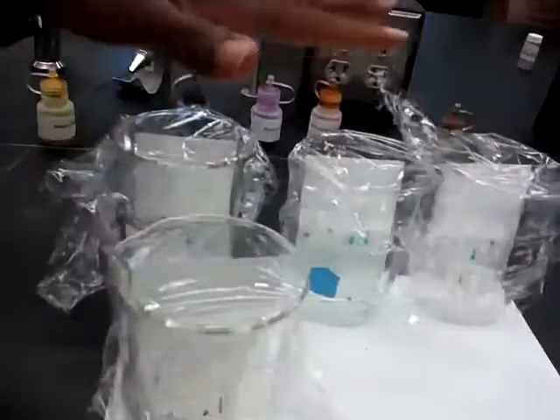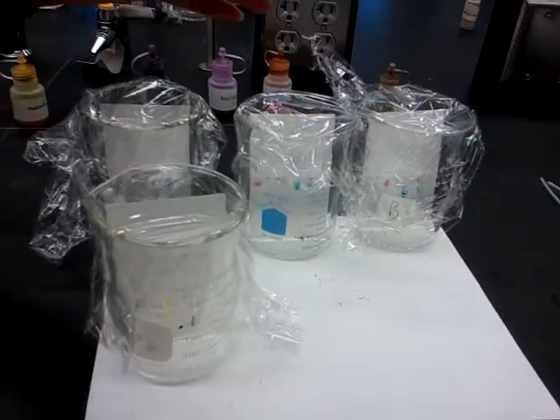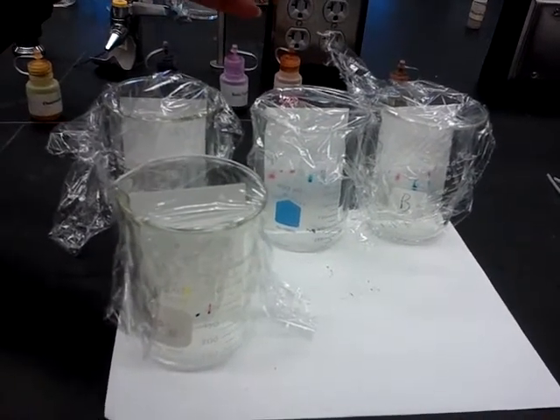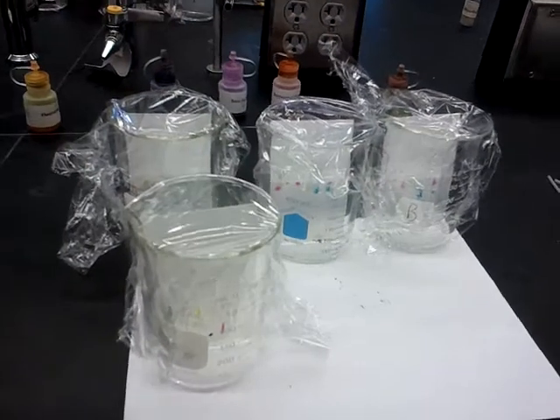You have your stationary phase, which is the actual card. And each one of these cards has coding on it and dots, so that's actually your stationary phase. The mobile phase is going to be the different solvents at the bottom.